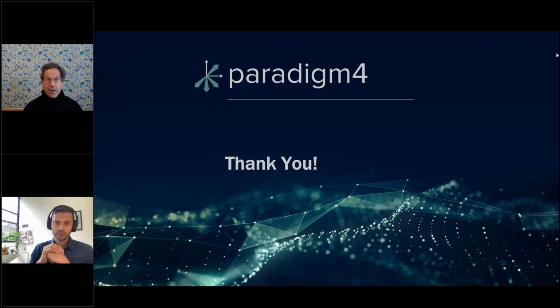So, we're on board. Right, and just to touch on Zach's point, the fact that we do these matrix linear algebra calculations so effectively makes it really helpful to do QC over years of instrument data or experiment data, and that's where we feel that our system can actually be really helpful with the ADF format. Right. So doing what Srikant means is like doing a principal component analysis on a matrix that's 10 million by 20,000 or a million, right?